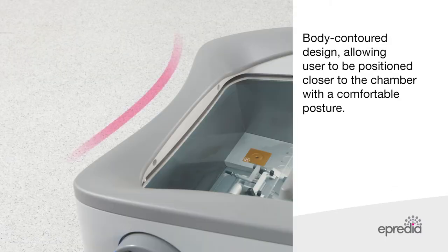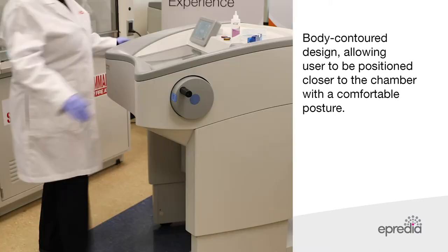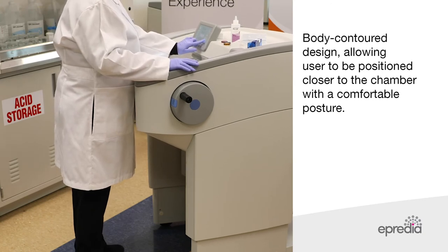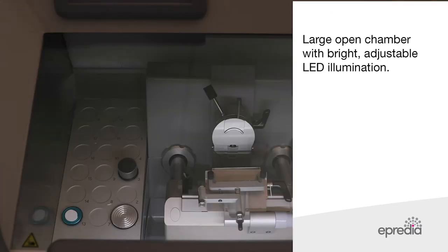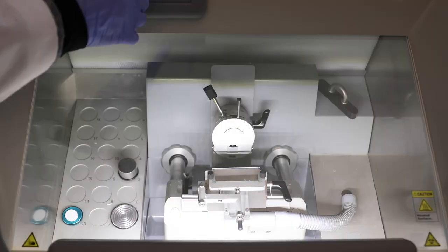The NX50 Cryostat has a body contoured design to allow the user to be positioned closer to the chamber to maintain comfortable posture. The NX50 has a large open chamber with bright adjustable LED illumination.